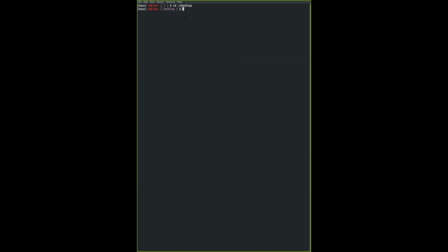Okay, so I can print out my desktop. There's nothing there. I don't usually keep stuff on my desktop, but you might have some other files and folders there.